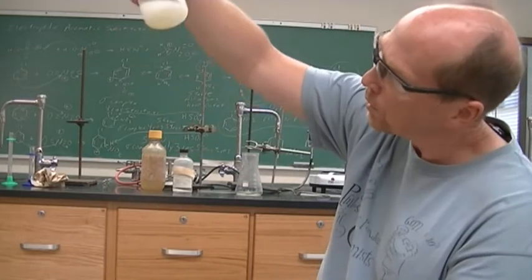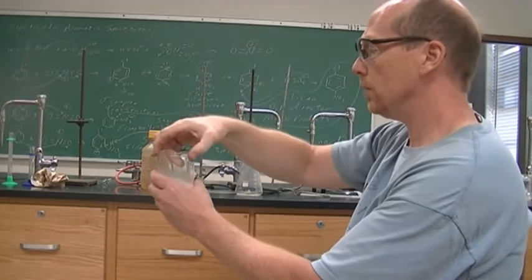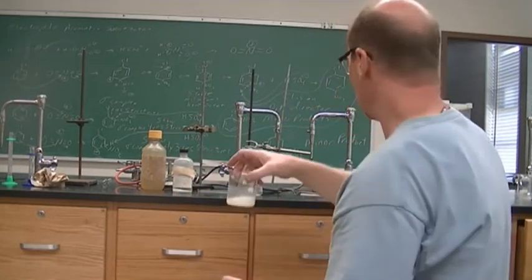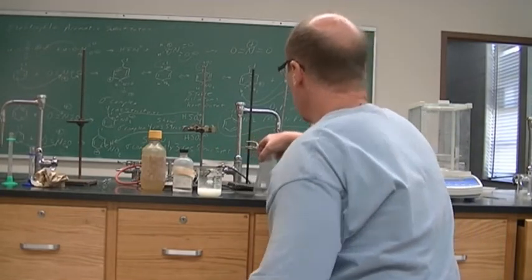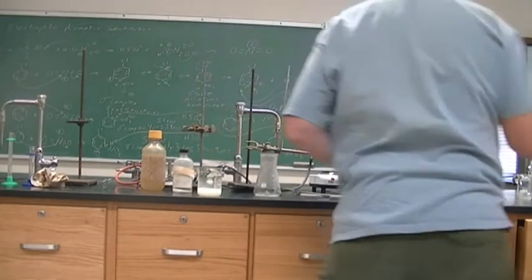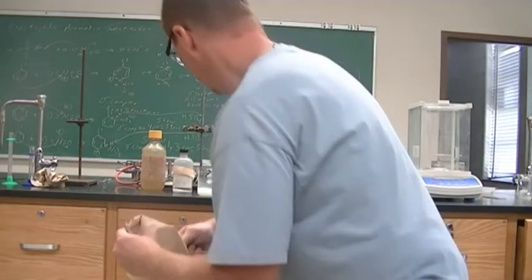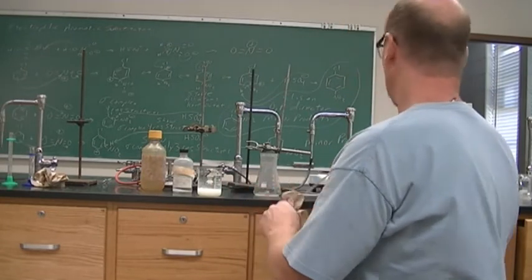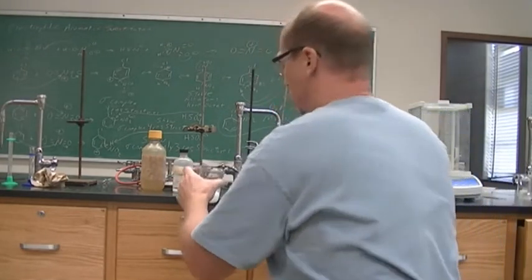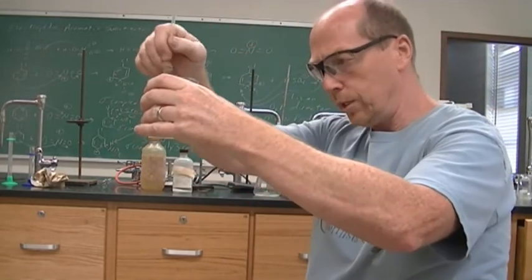All right, we have to make sure that our solid is in there. I might add a little more ice. Oh, we got some there. I'm going to stir it up with my stirring rod.